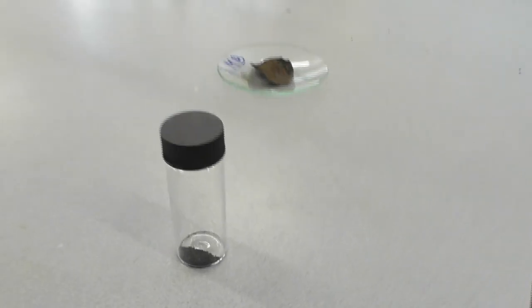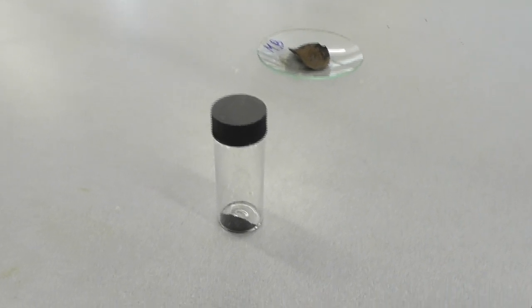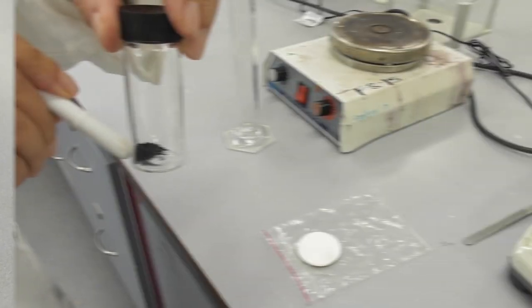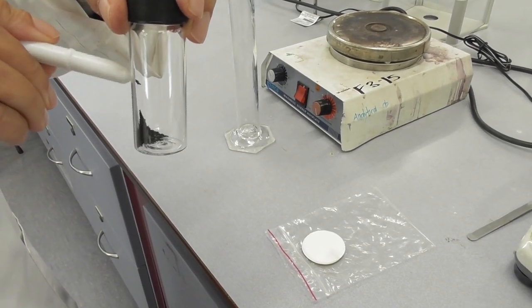The dried product gets transferred into a vial. Then I hold a magnet to the outside of the vial to check whether my product is magnetic or not.